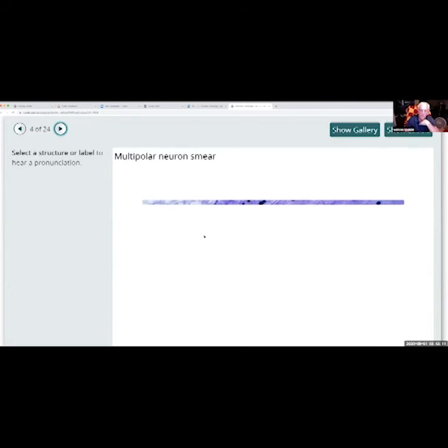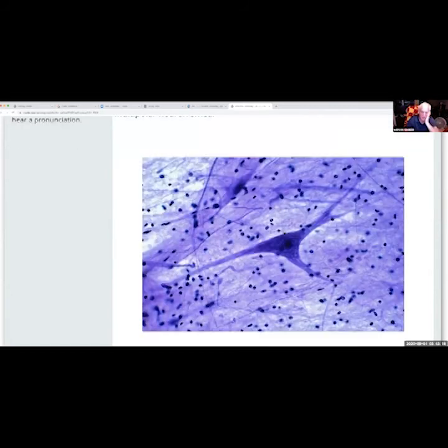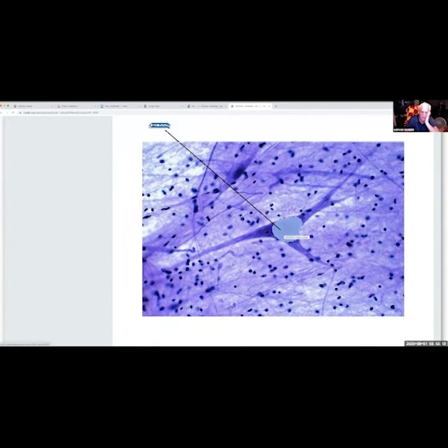Okay, you look at this one here. These are nerve cells. Again, this is the cell body. And then here's the hillock right here, where all the nerve cells come around, and this is your axon as it travels. And all these other ones back here are dendritic extensions, or dendrites, where information comes in.